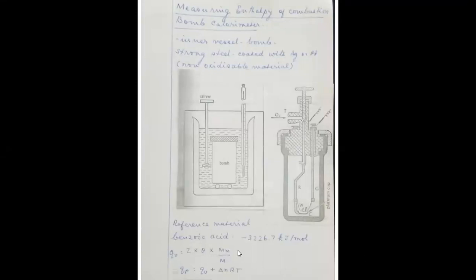So if you take benzoic acid, you know its molecular weight is 122, and its enthalpy of combustion is minus 3226.7 kilojoule per mole. So knowing this value, a known mass of the substance is taken and completely burnt with the help of the bomb calorimeter, and QV is known and Z is not known. Theta is the rise in temperature, M is the molecular weight of benzoic acid, and m is the mass of the benzoic acid taken. With this you can calculate Z.